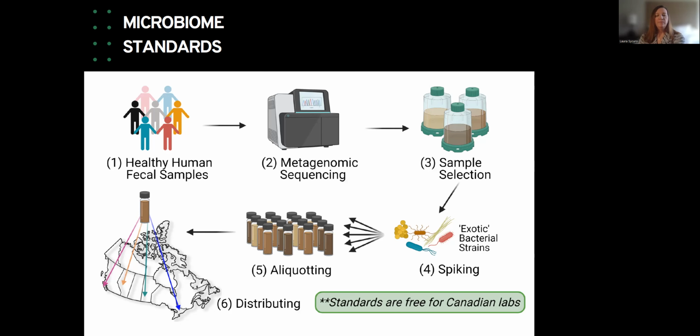Based on those profiles, Dr. Allen-Vercoe then suggested the 45 spike-in strains, and these are exotic strains, not because we've never heard of these microorganisms before, but because they differed substantially from what was already in the samples. We wanted to make sure that we could expect to really distinguish and detect the spiked-in known standards within the more complex fecal matrix and the community therein.